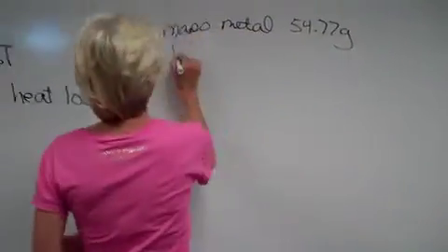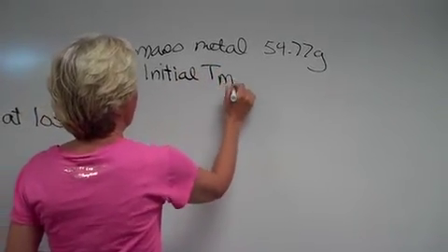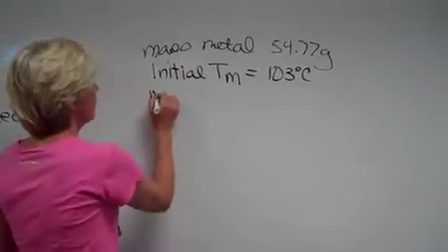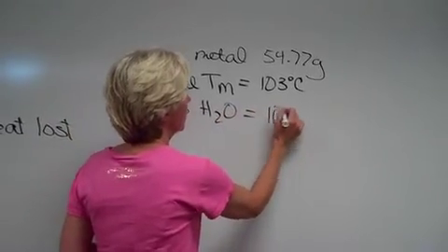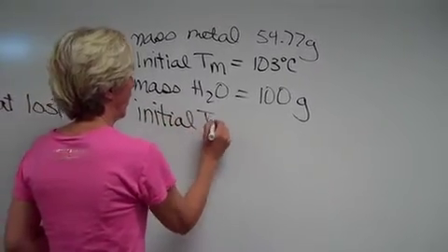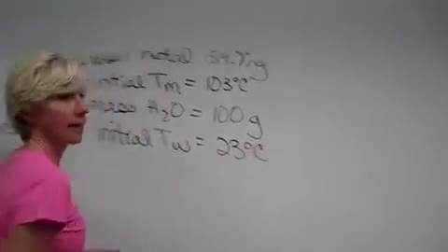Okay, initial temperature was 103 degrees Celsius. The mass of the water was 100 grams. The initial temperature of the water was 23 degrees Celsius.